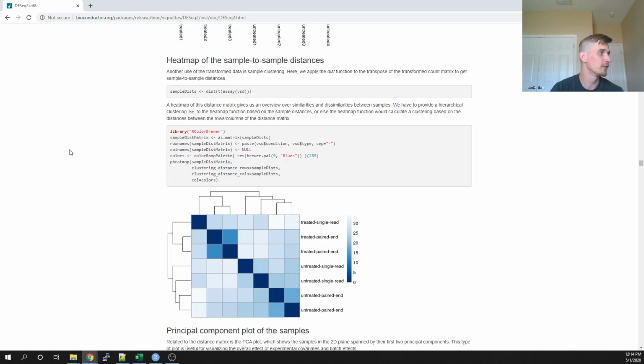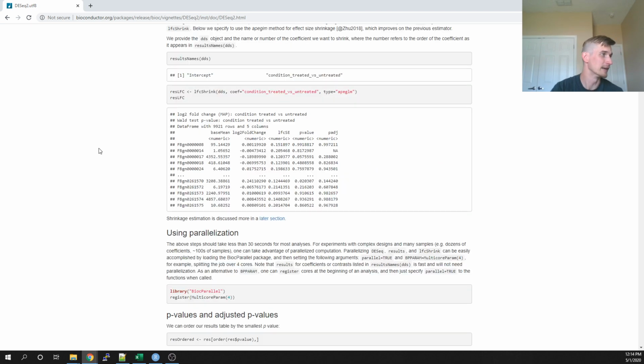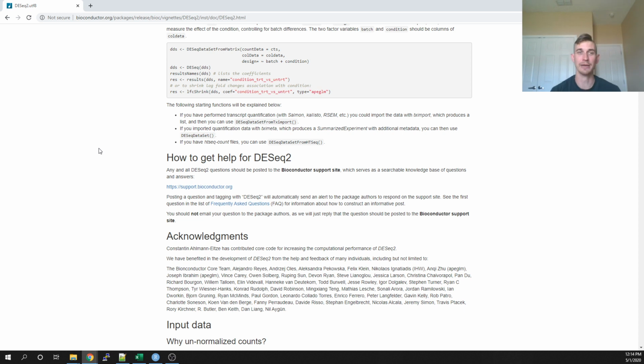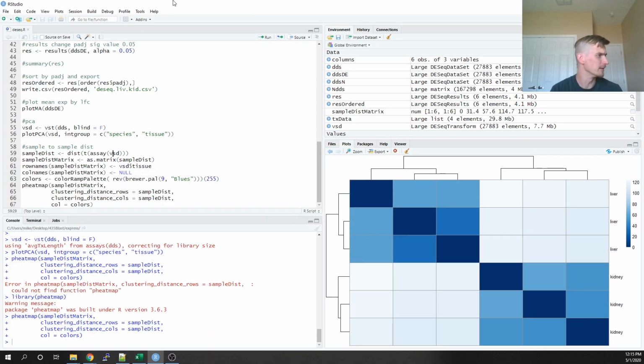Understanding what the manual is saying takes more time than actually doing it. It's definitely not all intuitive, but everything that I've plotted out in this script is more or less the distilled need-to-know stuff. Everything that I've written down is basically what you need to know to make this work.